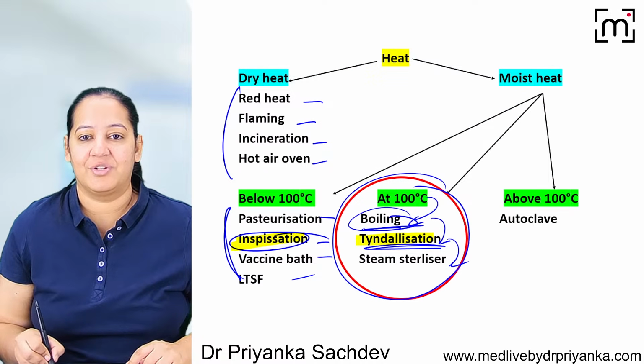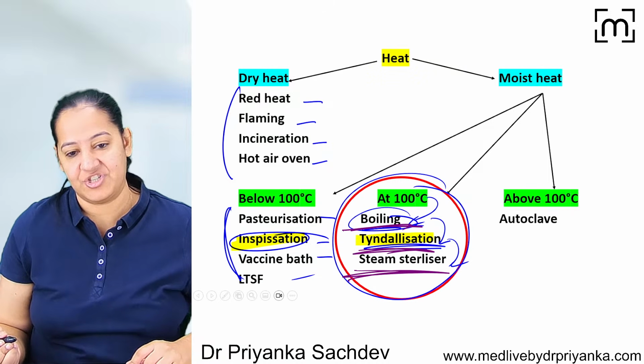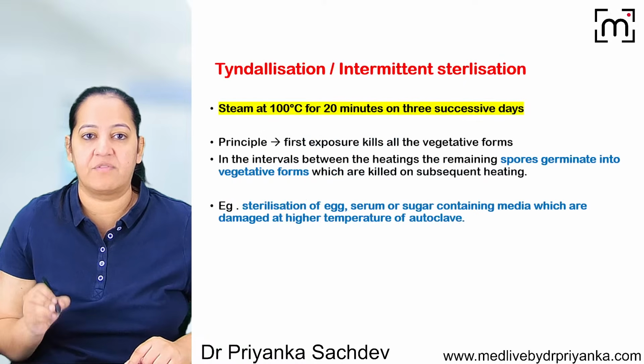So we are done with Tyndallization also. We are done with boiling. We are done with Tyndallization. And now I'm coming to steam sterilization, the third and the last one here. The steam. So see the details of Tyndallization first.